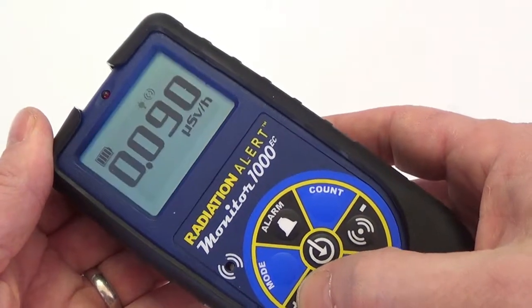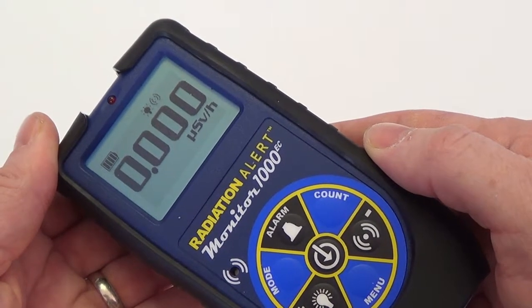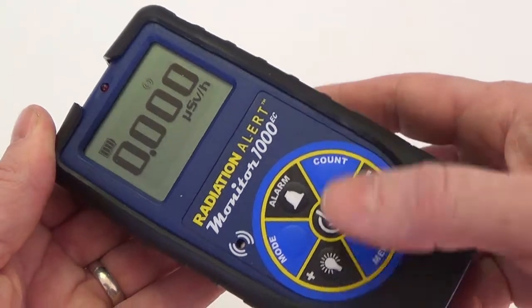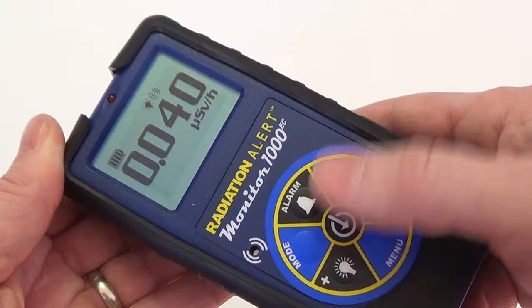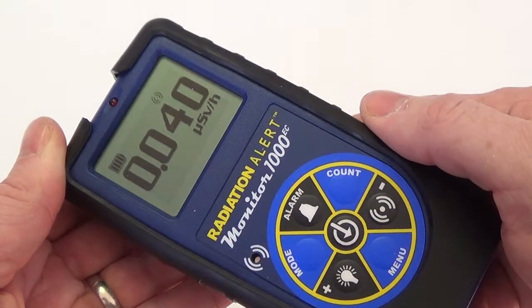Turn on the backlight by pressing the backlight button. The backlight will stay on for the preset time of seven seconds. To turn the backlight on for the duration of your survey, press and hold the backlight button for three seconds until it beeps. You can then turn it off by pressing and holding it again until the backlight turns off.